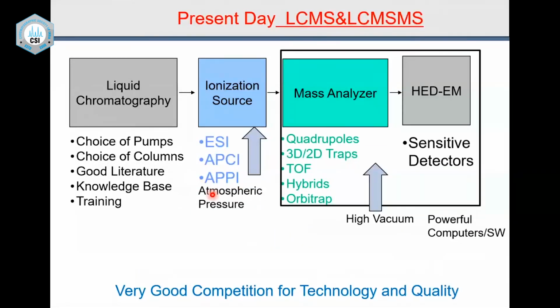I made it very simple for people. They say, oh, I am very much scared about atmospheric pressure ionization and electrospray and all that. I made it very simple. It is nothing but ionization under atmospheric pressure. So I deflate the balloon. There is nothing to worry about. Atmospheric pressure ionization is nothing but ionization at atmospheric pressure.